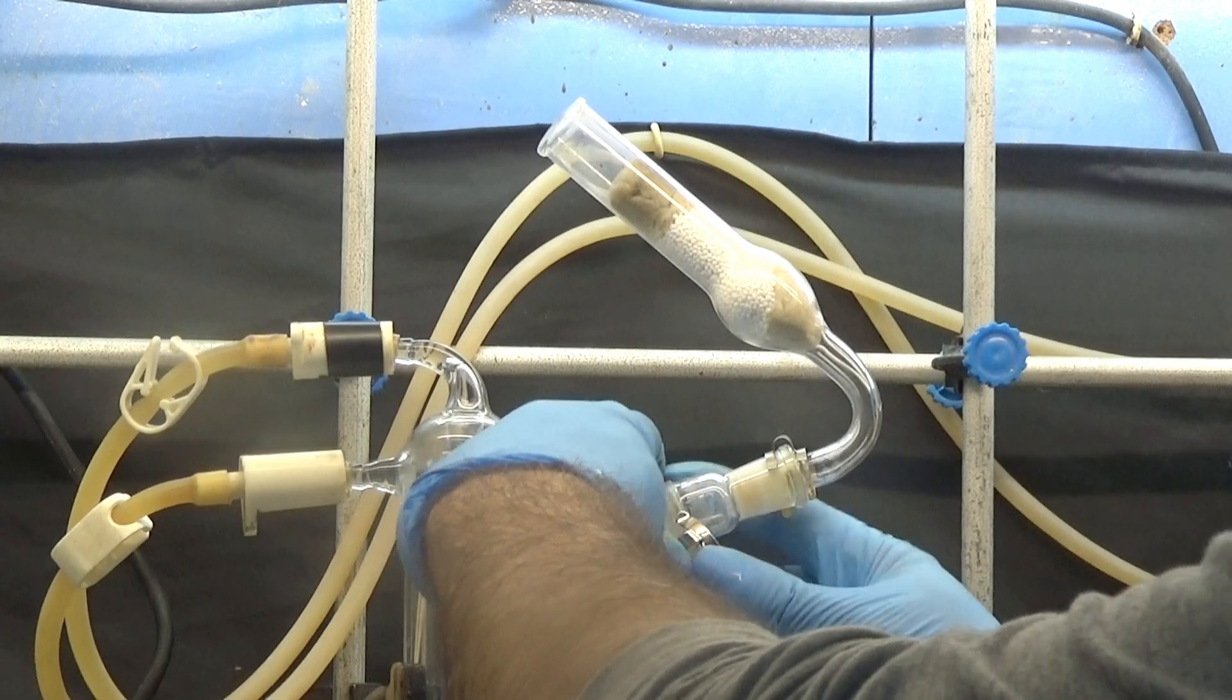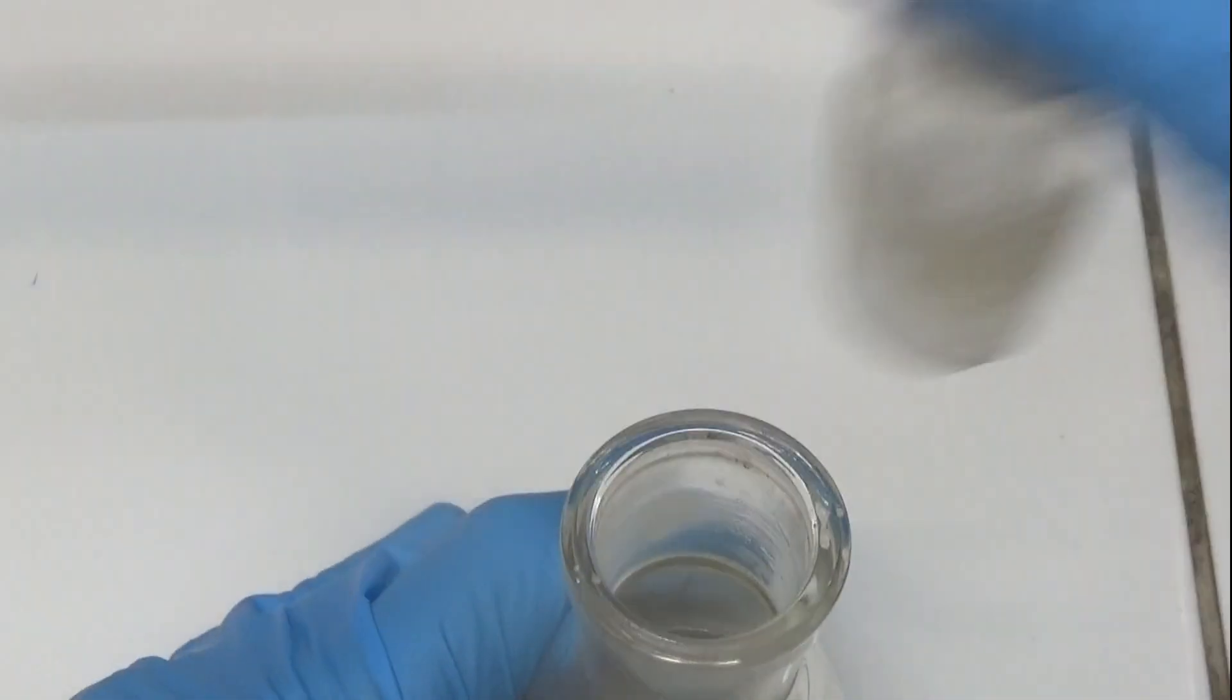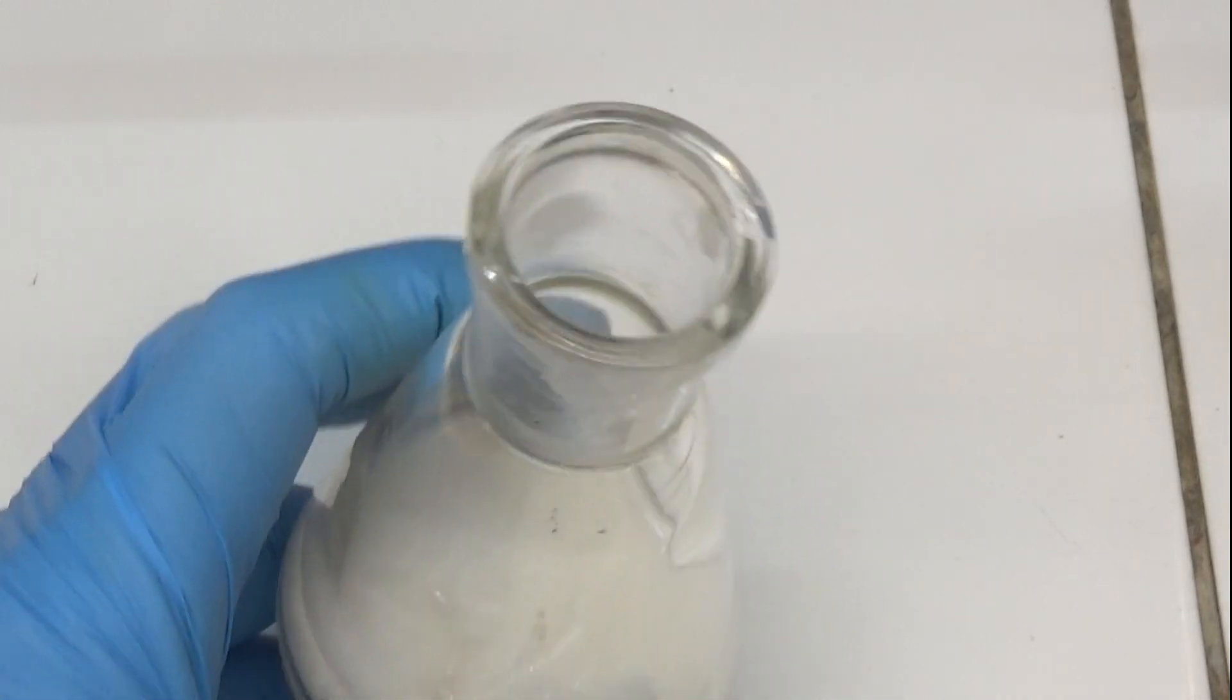Calcium chloride tubes can be used to protect the reflux condenser from moisture. We let it cool for an hour and observed a white solid that has crystallized.